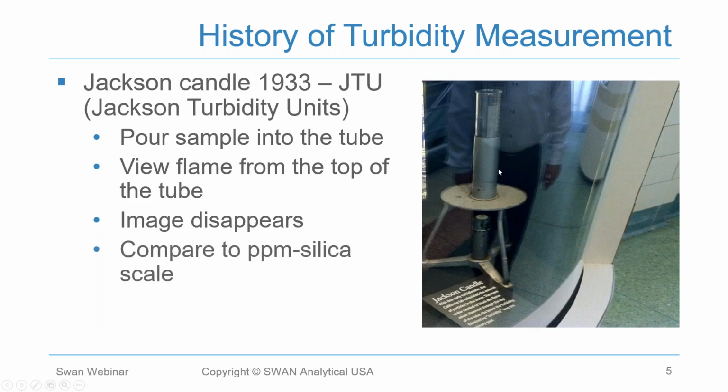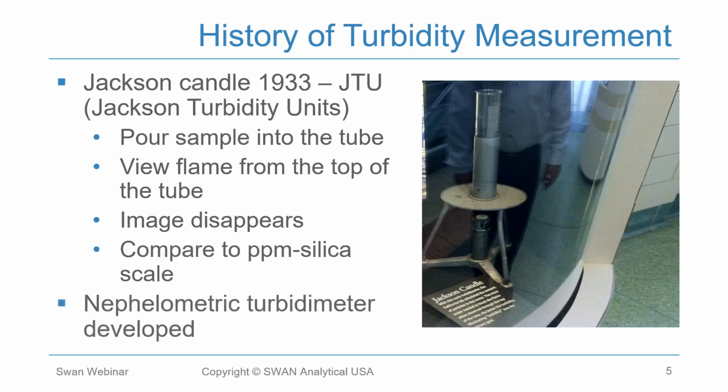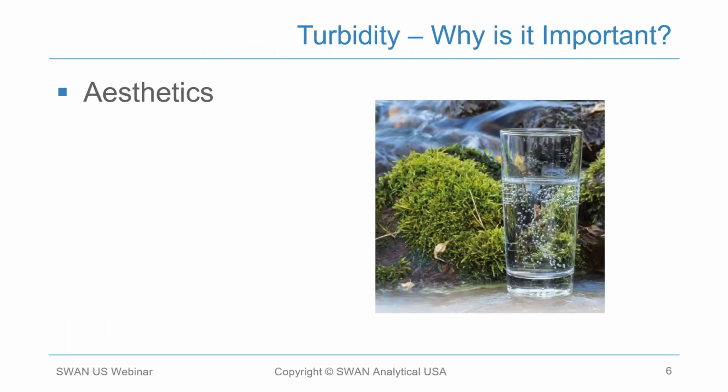This method was actually in use for about 37 years. It wasn't until the 1970s that the Nephelometric turbidity units that we use nowadays were developed. So why is turbidity important?